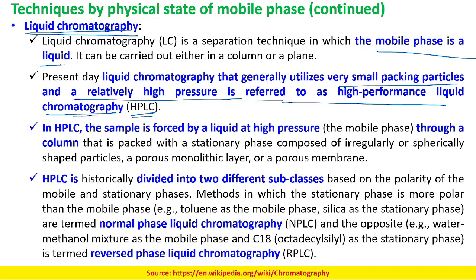In the previous case, the elution was happening only due to gravity, and over there we did not have any control to modulate the flow of the mobile phase. However, in this case we have a technique to control the flow of the mobile phase by using a pump. The pump may use a compressed gas, or it may be a pulsatile flow pump, or a continuous type pump, which will be continuously putting a pressure onto the column, so that there is a uniform flow of the liquid throughout the column. Okay.